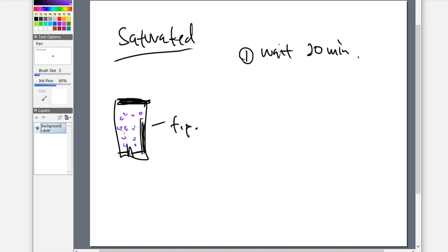So equilibrium is going to come to a halt at some point during that 20 minutes. We're giving it time for that process to happen, and then these components are generating that gas phase, which is going to help separation and help latch onto the plate and do what it needs to do. But it is going to make our separation here a little different. So it is not a dry plate.